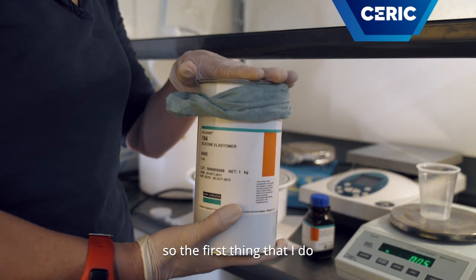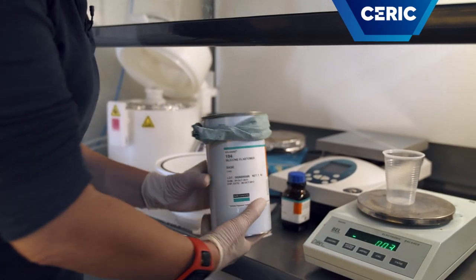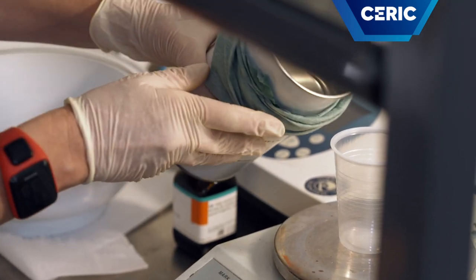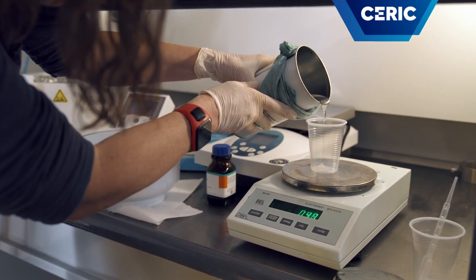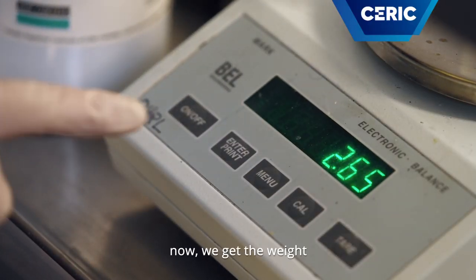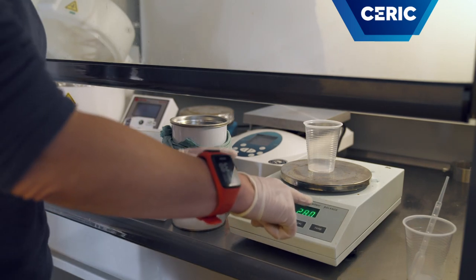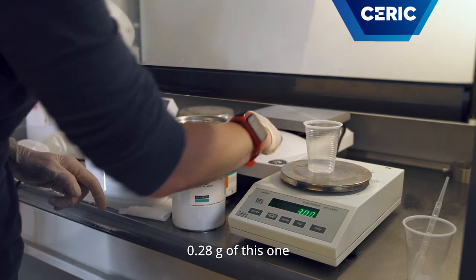So the first thing I do is pour the resin into our container. Now we get the weight, which is 2.8 grams, and then we have to put 0.28 grams of the curing agent.